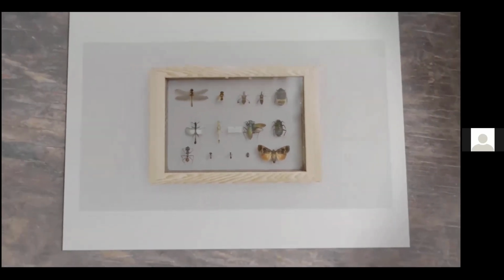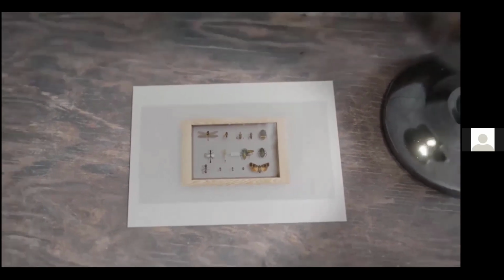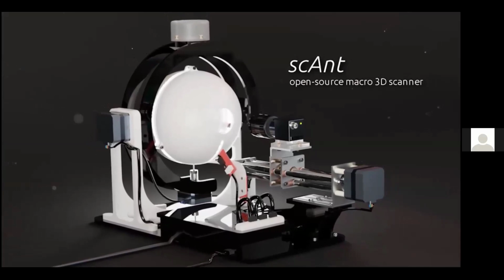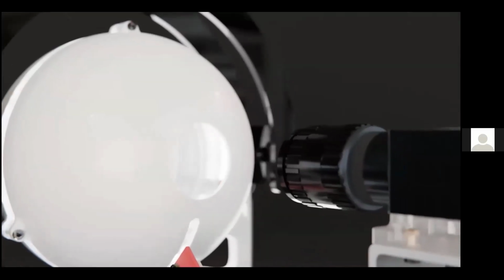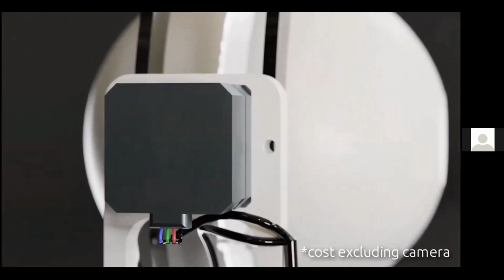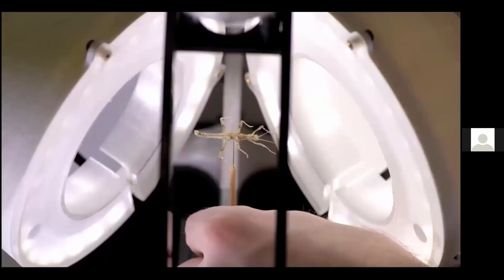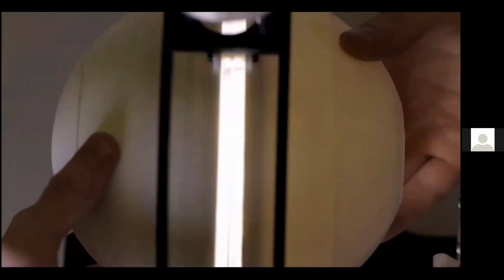Just to confirm, there are large natural history collections. Plenty of these mean that if you want to access the specimen, you have to go there. If you go there, you have to take out the specimen physically. That comes as risk to damage them. And people take images, but these are 2D. And to overcome this problem and provide 3D images, we've developed a system that we call scAnt that can help people to make 3D models. And you see here basically a video of the process.